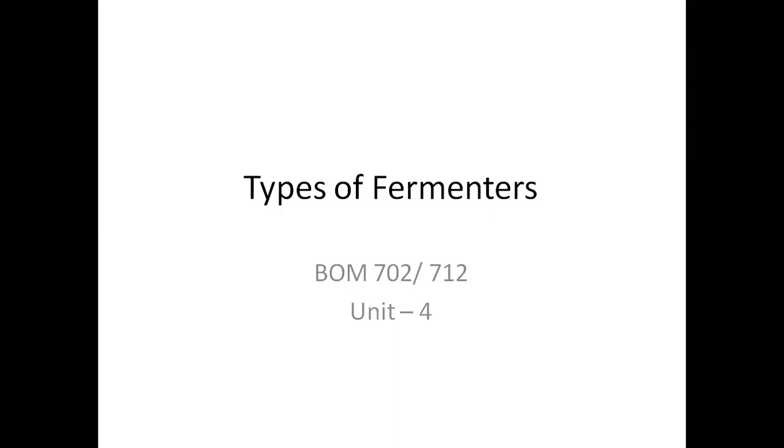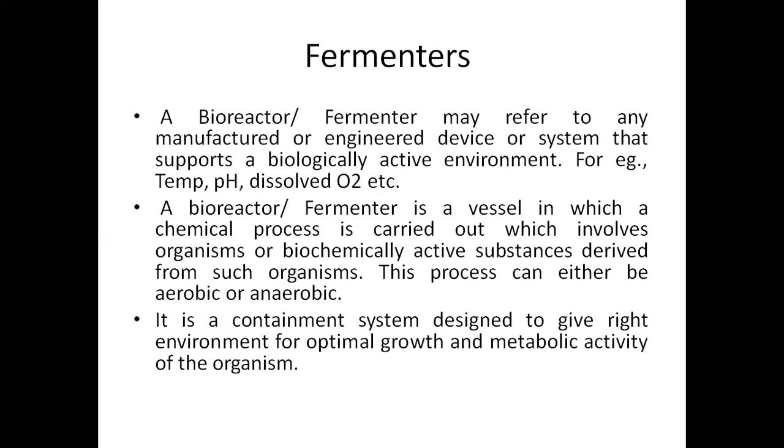So basically there are different types of fermenters, and all of them have different properties and structural differences which are utilized for different types of processes. So we'll be studying the different configurations of the fermenters and the basic bioreactor design also. So first of all, let us start with the definition of the fermenter.